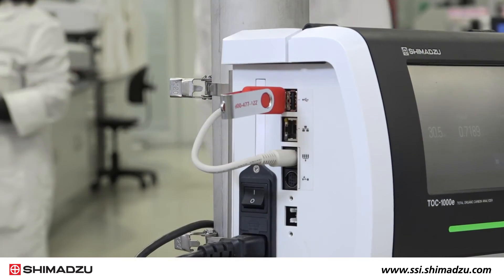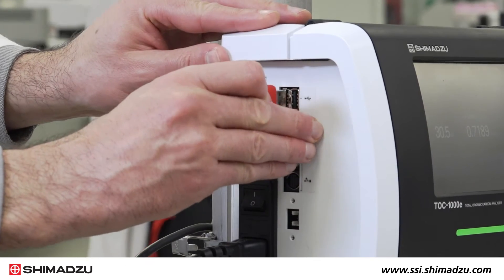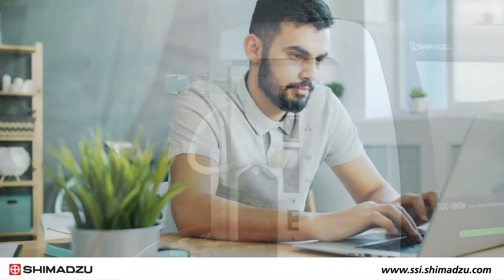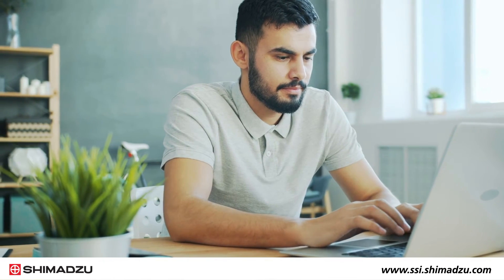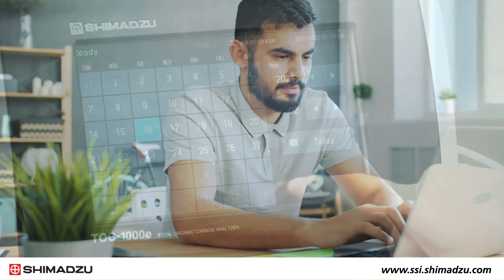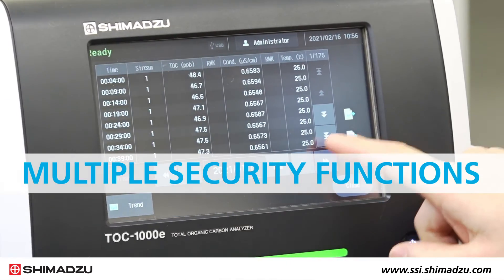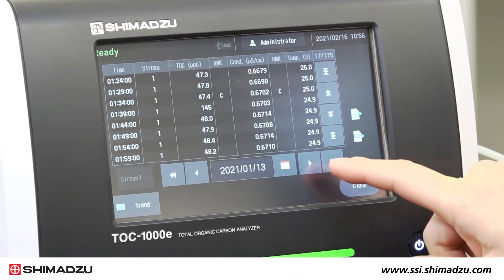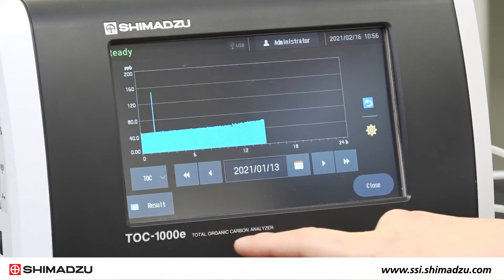The TOC1000E can output data to a USB flash drive in text, CSV, or PDF format. You can also check results remotely from a web browser without the need for special software. Additionally, the TOC1000E is equipped with multiple security functions supporting data management procedures and compatibility with 21 CFR Part 11.